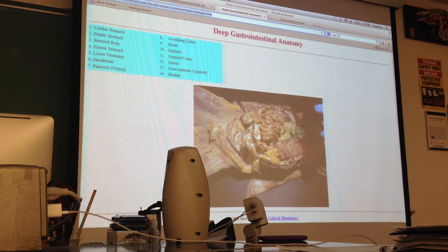This is going to be really helpful to do because if we're going to be showing you the different segments of the small intestine, just like I explained, we'd be showing it to you with the body models. We're going to be showing it to you because it's going to be connected to the stomach. So we'll pull it out like this. Usually it kind of just juts deep, so you may have to do a little bit of digging, but it's not that bad. So dig out the duodenum, and again, we'd show it to you as being connected to the stomach. I'd say about 4 inches out. It's about as far as we'd go, okay, if we're calling it the duodenum.